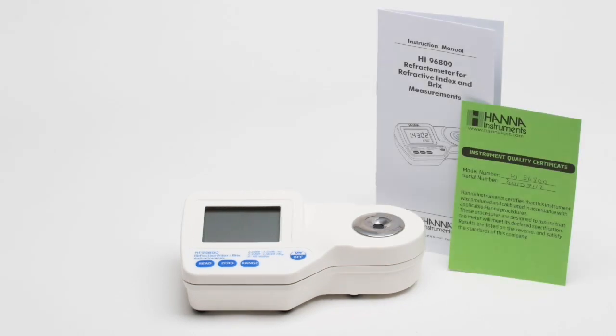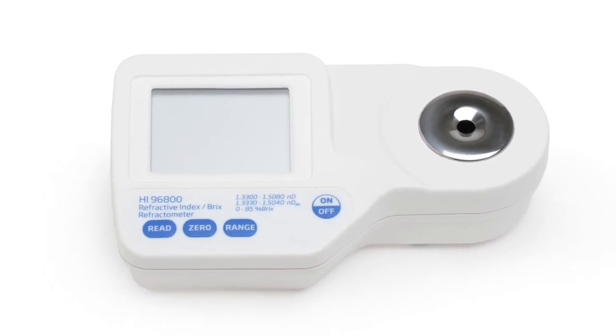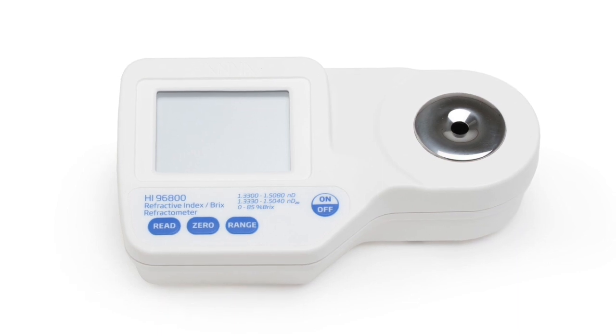Each new refractometer is supplied with an instruction manual, testing certificate, and 9-volt battery so the user can start taking measurements right out of the box. The HI-96800 meter is housed in a rugged, water-resistant case that holds an IP65 enclosure rating.